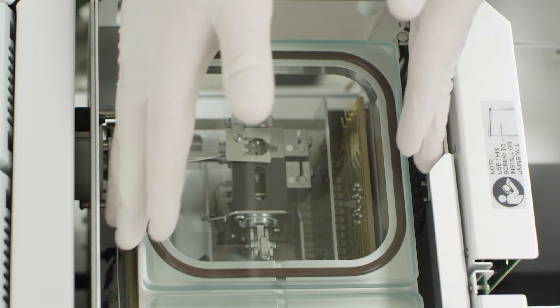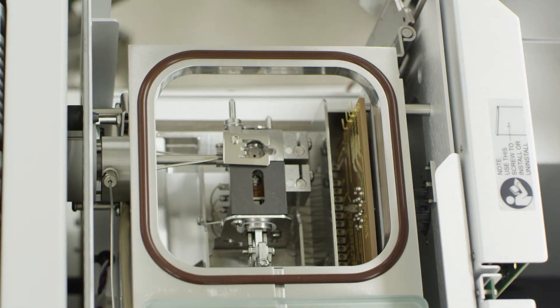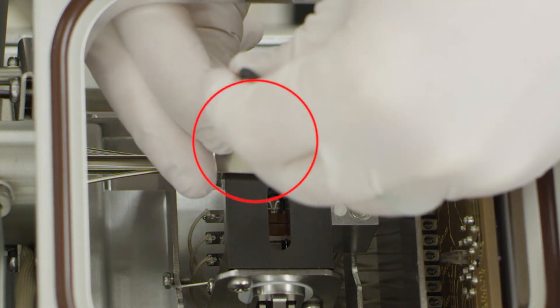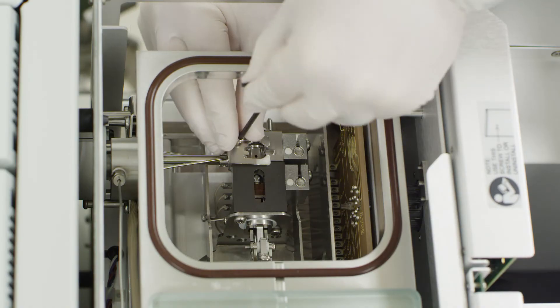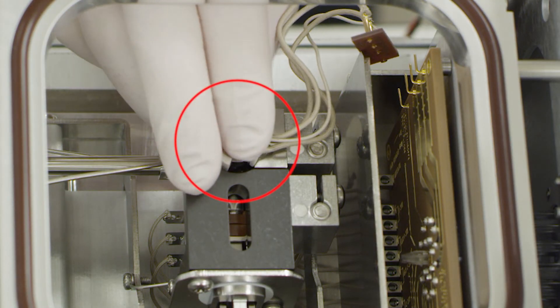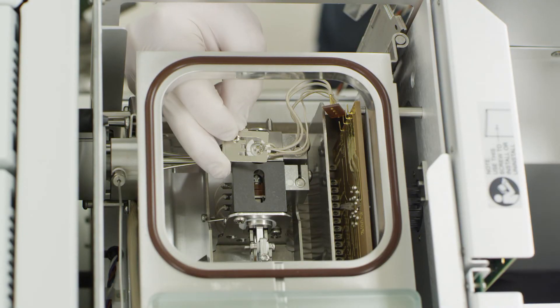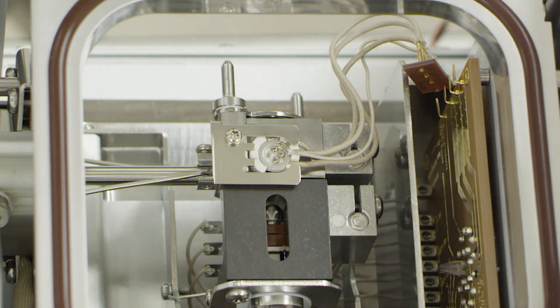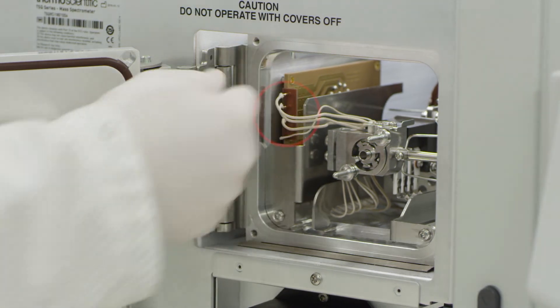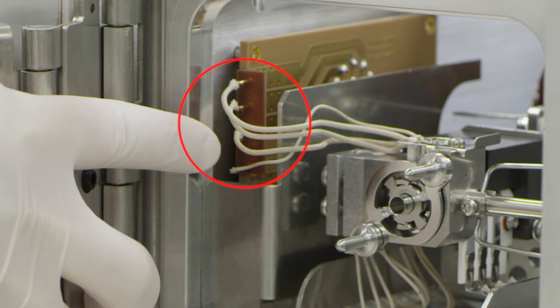Remove the glass top to allow greater access to the top side of the source assembly. Do not pry with sharp tools as this could risk damaging the seal to the chamber. Locate the filament bracket and remove it. Place the filament and then replace the filament bracket. Connect the filament to the source interface board on the left. The filament connection is spaced in such a way that it may not be installed incorrectly. Never force any piece to fit during installation.